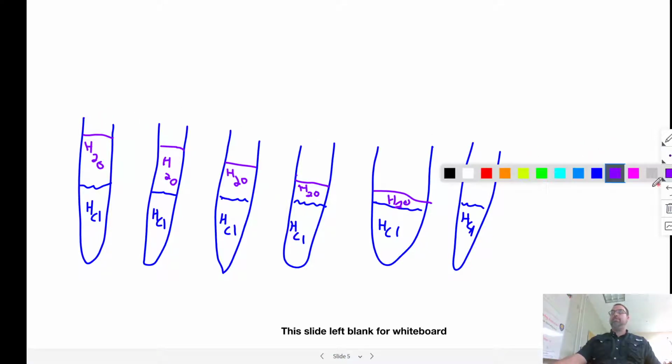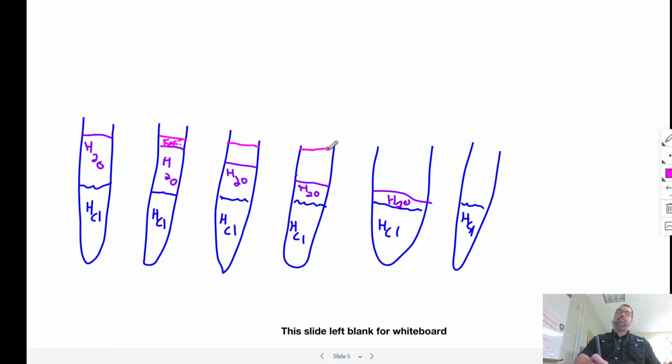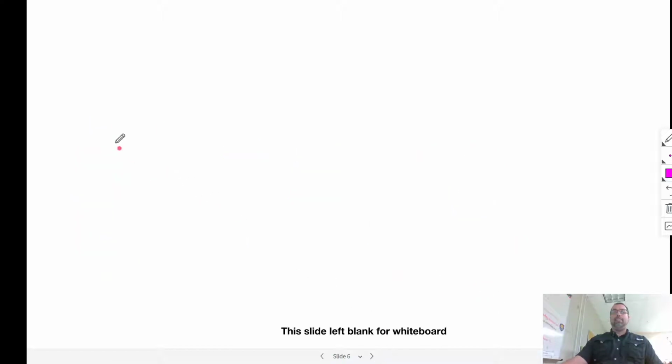To all the rest of our test tubes, we ended up adding some of our ethyl ethanoate. Okay. And we added that to correspond with the water so that we had a total of 10 milliliters in each container. Okay. What we ended up getting at the end was a test tube where we ended up having an equilibrium go on.